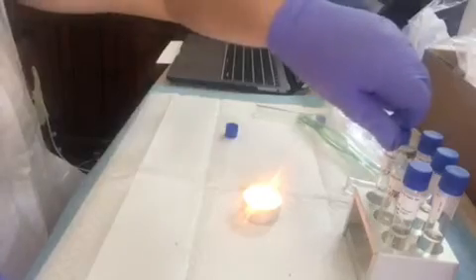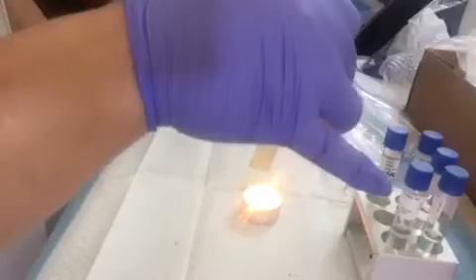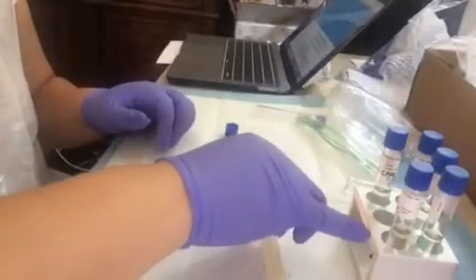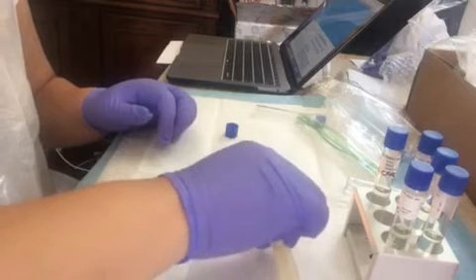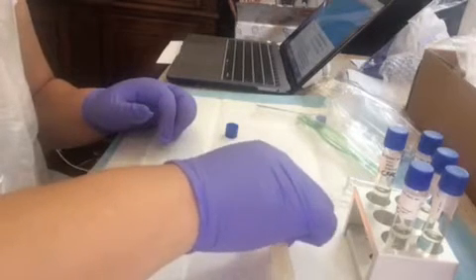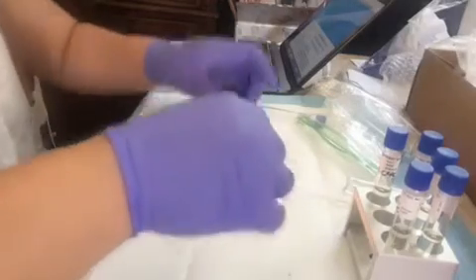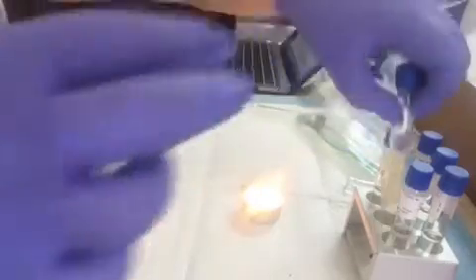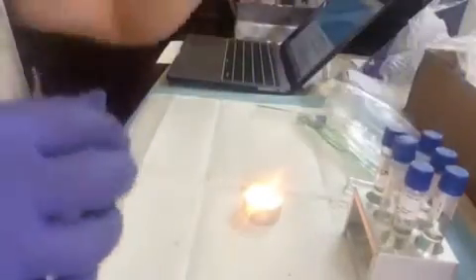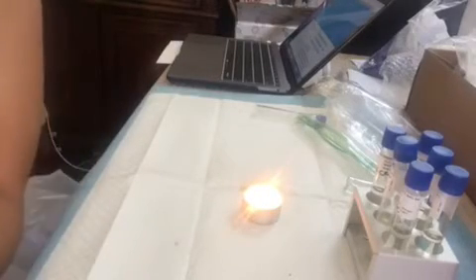I'm just going to flame the lip for the culture as well. Alright, so now we're going to incubate for 48 hours and we'll go check on that.